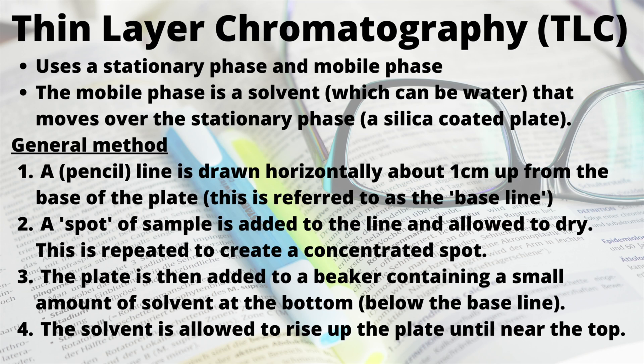The general procedure for using a TLC plate is very simple. We draw a pencil line about one centimeter up from the base of the plate — we call this the baseline. You must use a pencil because ink could be soluble in the solvent and start to travel with the spots, which are the components of the mixture. We then create an initial concentrated spot of our sample on the baseline using a capillary tube, letting it dry and repeating this process each time.